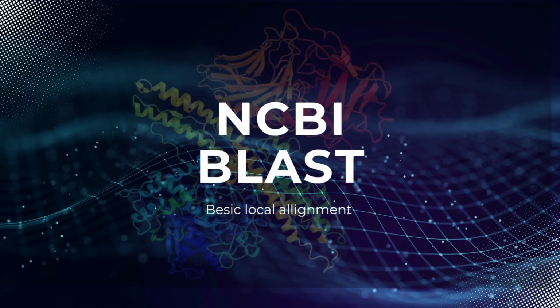In this video, we will discuss NCBI BLAST, one of the most important bioinformatics tools used in biotechnology, genomics, and proteomics. If you are a B.Sc, M.Sc, or research student, understanding BLAST is absolutely essential. So let us begin. BLAST stands for Basic Local Alignment Search Tool. It is developed by NCBI and is used to compare a DNA or protein sequence with sequences stored in public databases. BLAST performs local alignment, meaning it finds regions of similarity, not necessarily the entire sequence. This makes BLAST fast, efficient, and highly reliable.